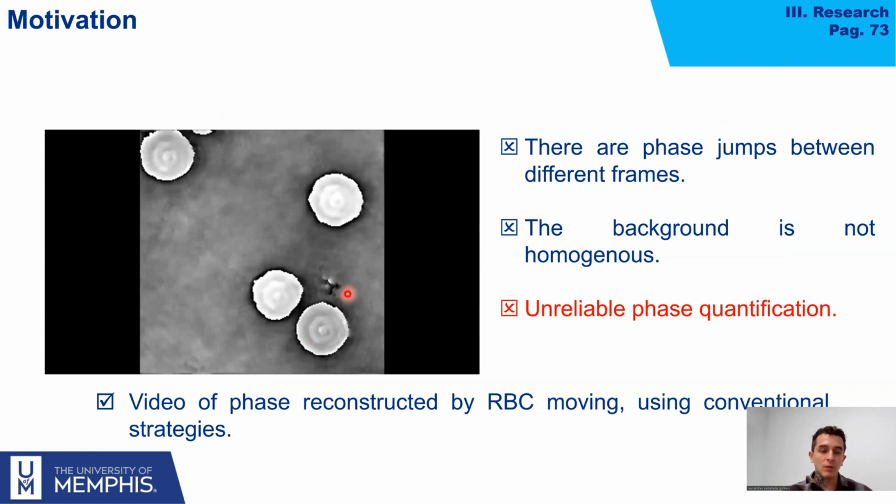So, for instance, this is a video of phase reconstruction of red blood cells moving using conventional strategies. Let me reproduce this video.